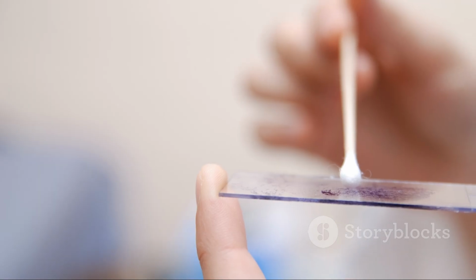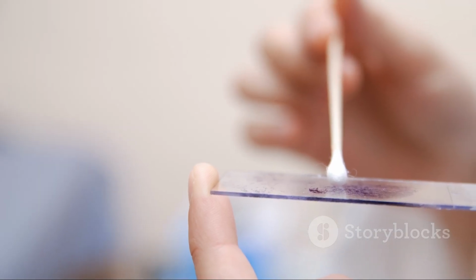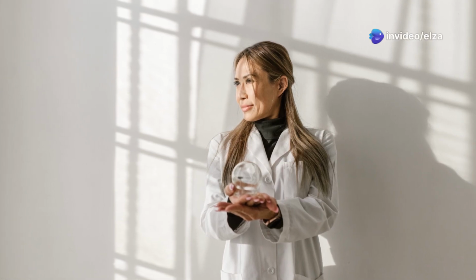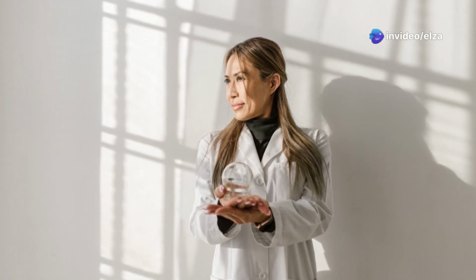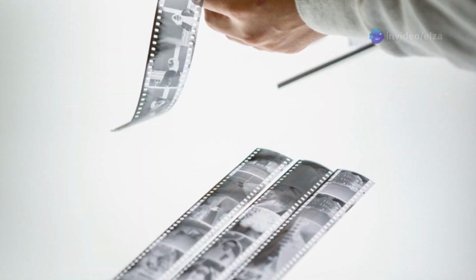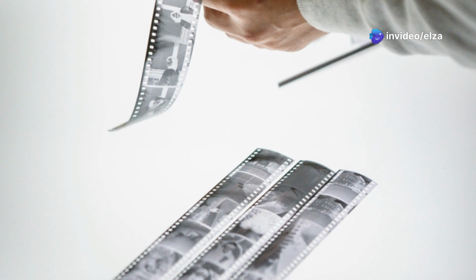The specimen is then coated with a photographic emulsion containing silver halide crystals. The coated specimen is exposed in a light-proof container for a specific duration. During this exposure, the radiation from the isotopes interacts with the silver halide crystals. This interaction creates a latent image, which is invisible to the naked eye.